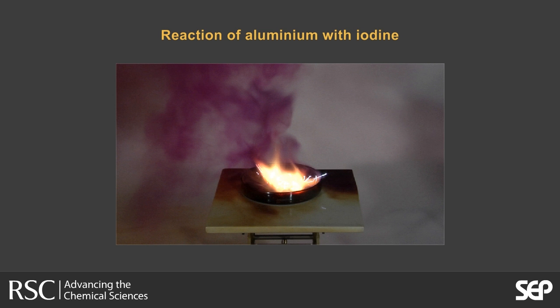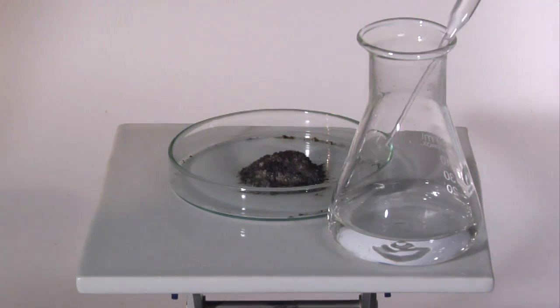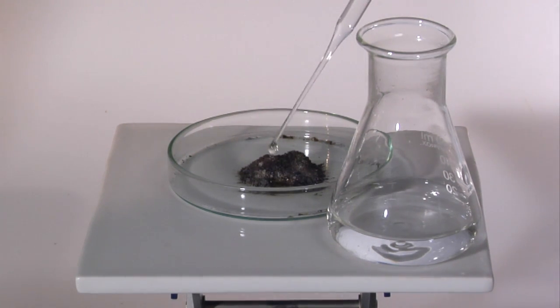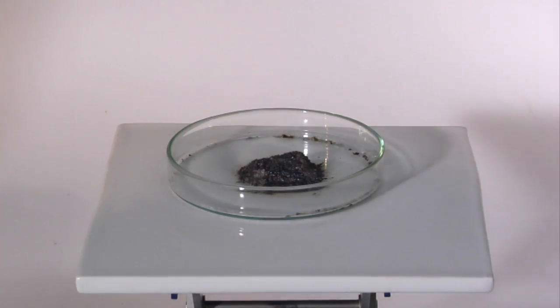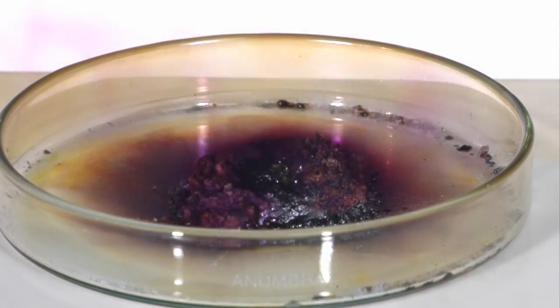In this demonstration, a small pile of mixed aluminium with iodine is placed on a glass dish. Water is added to initiate the reaction. The reaction is highly exothermic.